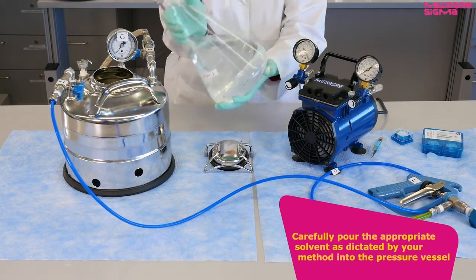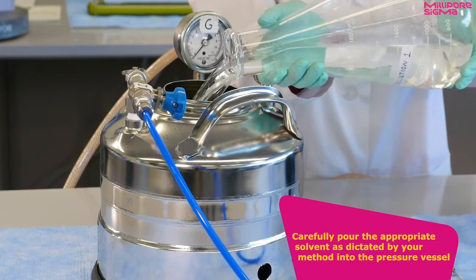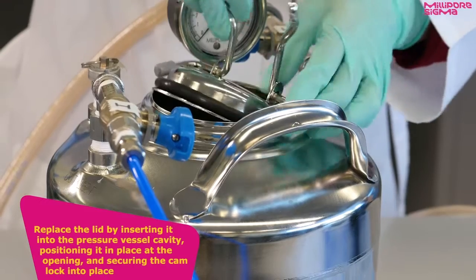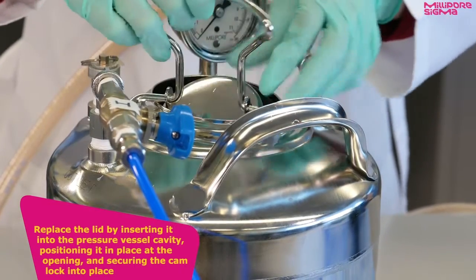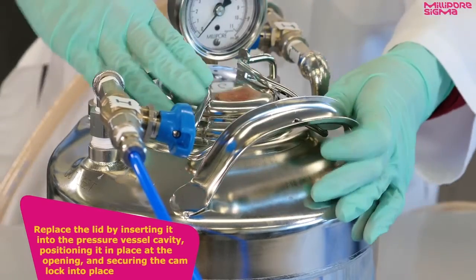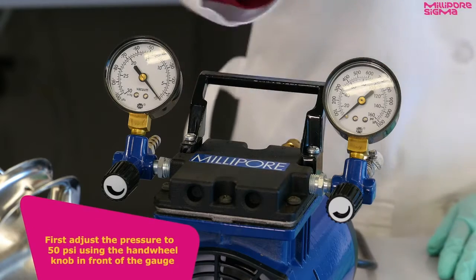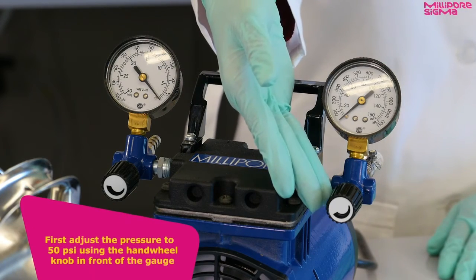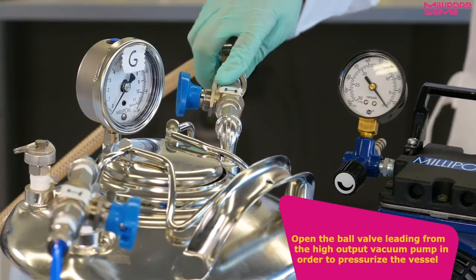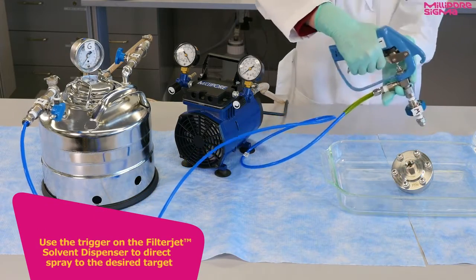Carefully pour the appropriate solvent as dictated by your method into the pressure vessel. Replace the lid by inserting it into the pressure vessel cavity, positioning it in place at the opening, and securing the cam lock into place. You are now ready to rinse your parts. First, adjust the pressure to 50 psi using the hand wheel knob in front of the gauge. Open the ball valve leading from the high-output pump in order to pressurize the vessel. Use the trigger on the FilterJet to direct spray to the desired target.